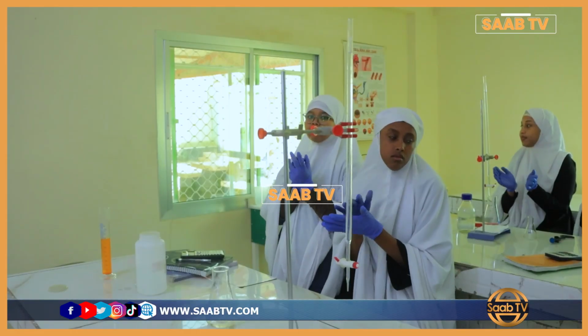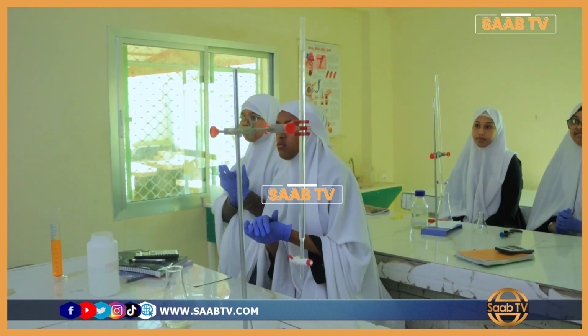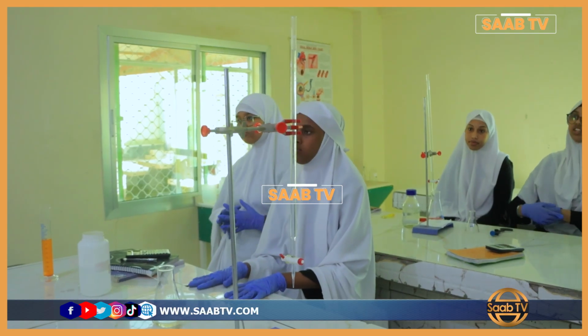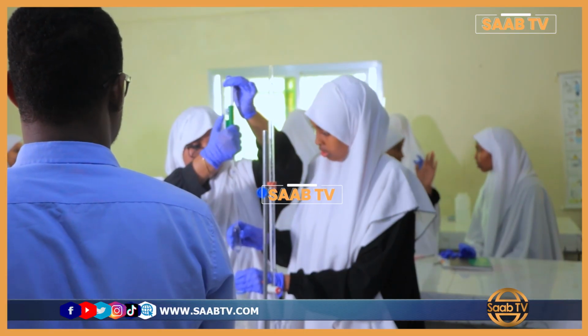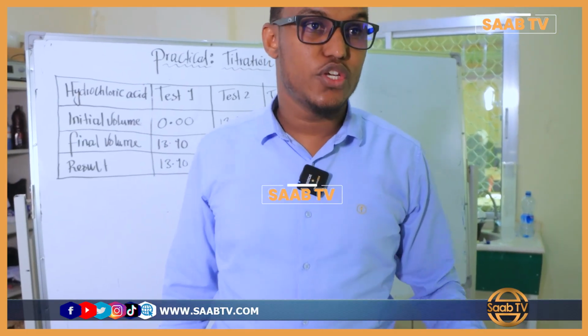So let me give the chance to each student, maybe each two students, to go to their table for the experiment, and I'm going to observe how they do the practical. So let me give the chance to each two students.